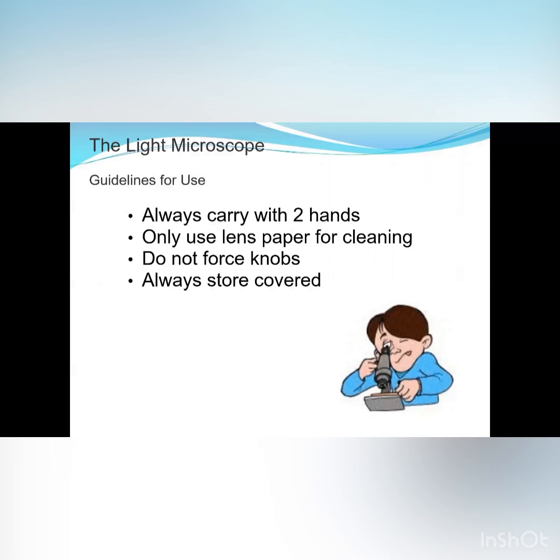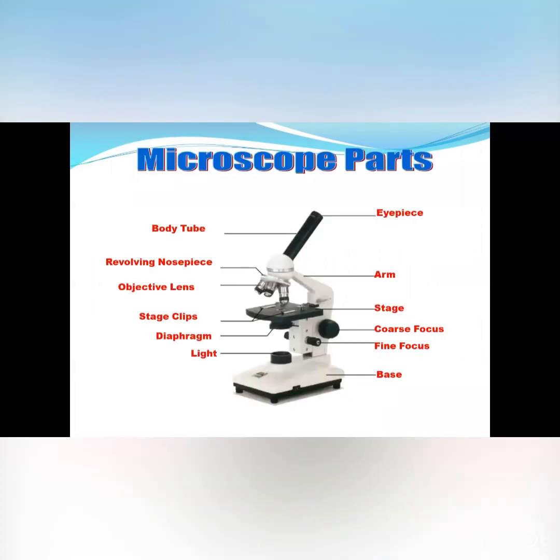There are some guidelines for using the light microscope. Always carry it with two hands, only use lens paper for cleaning, do not force the knobs, and always store it covered. So these are the essential ones that you should be careful about.